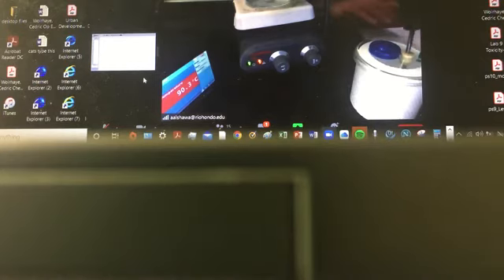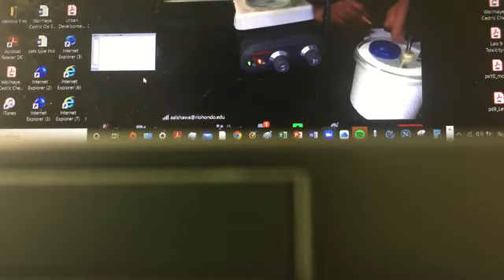I'm presuming. So I guess we can stop the heat of that metal, and then I'm going to transfer the metal straight into that calorimeter and follow the software. But before, let me initiate the software. So once again, check it on that timer, continuous, pretty good. And I'm going to start the software. So easy collect. So now the software is starting.